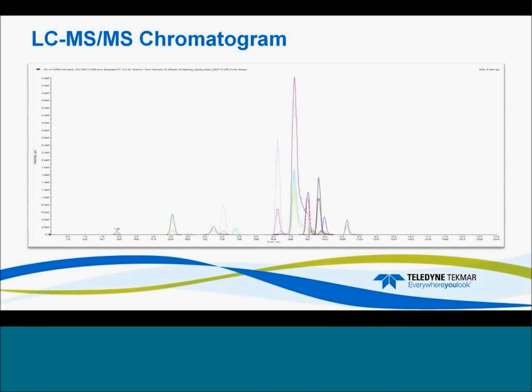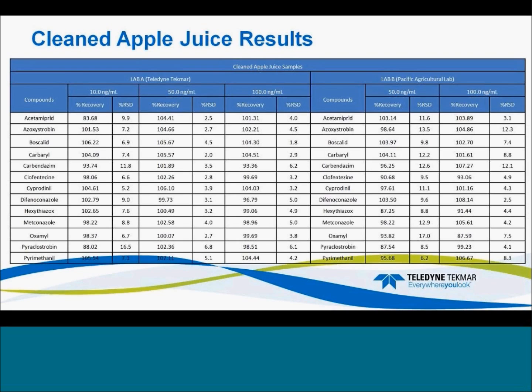Basically just an LC-MS chromatogram from us here at Tekmar. And here are the apple juice results. So we looked at two different types of studies. We looked at apple juice that was sent through a DSPE cleanup step and without a cleanup step.